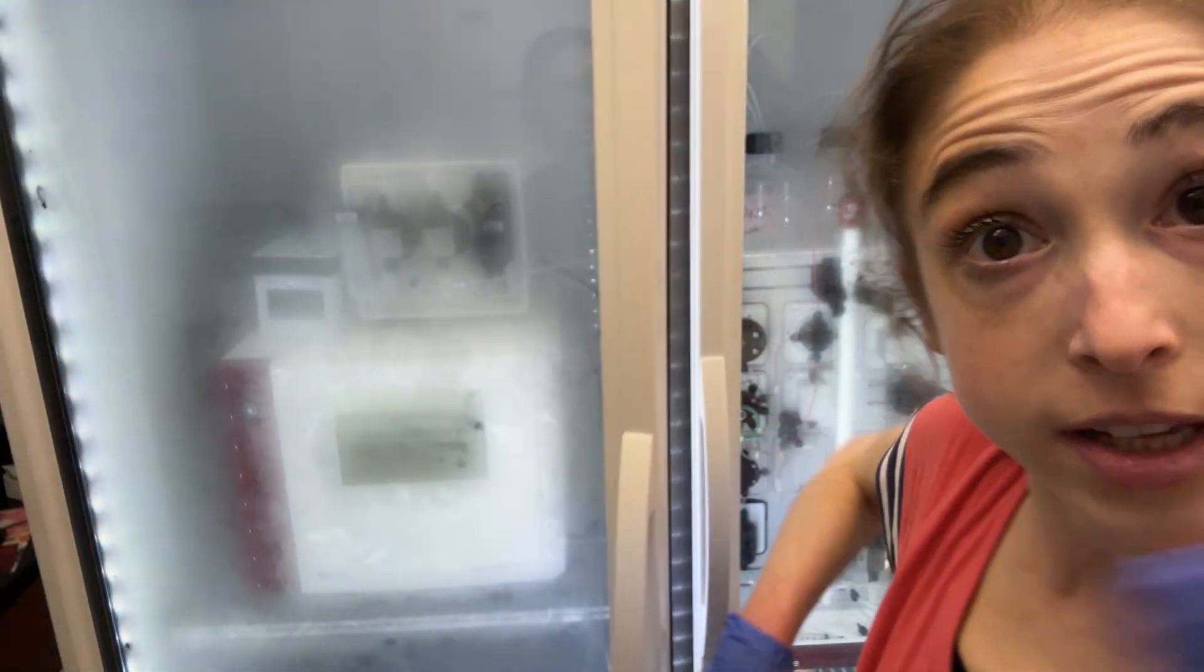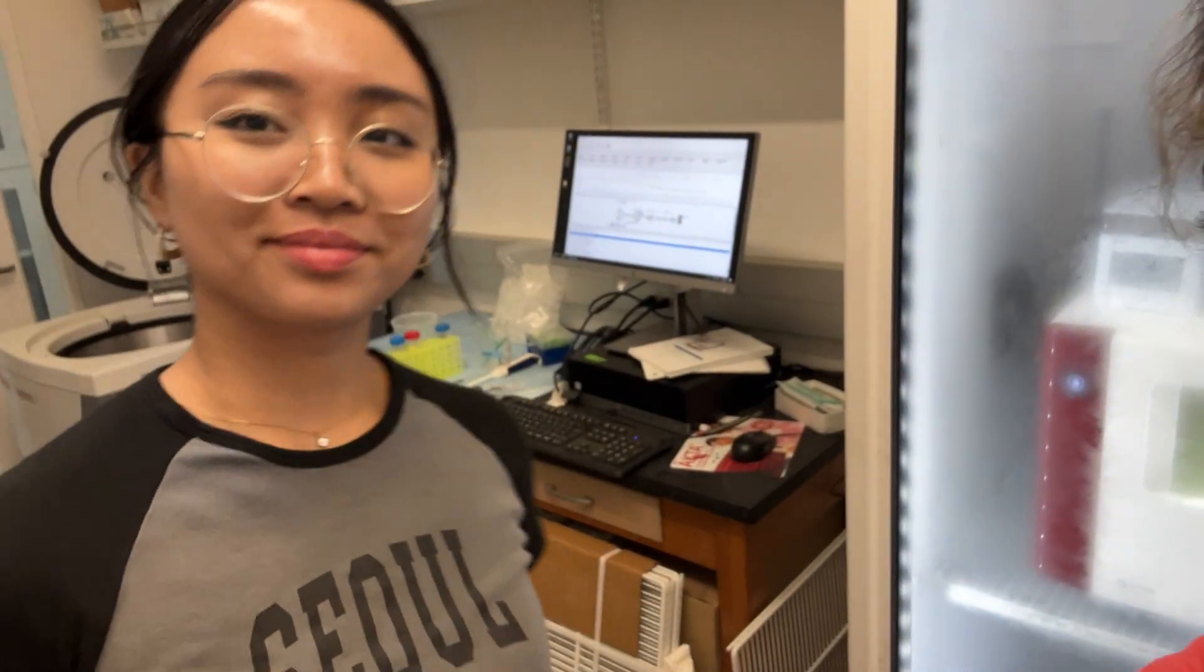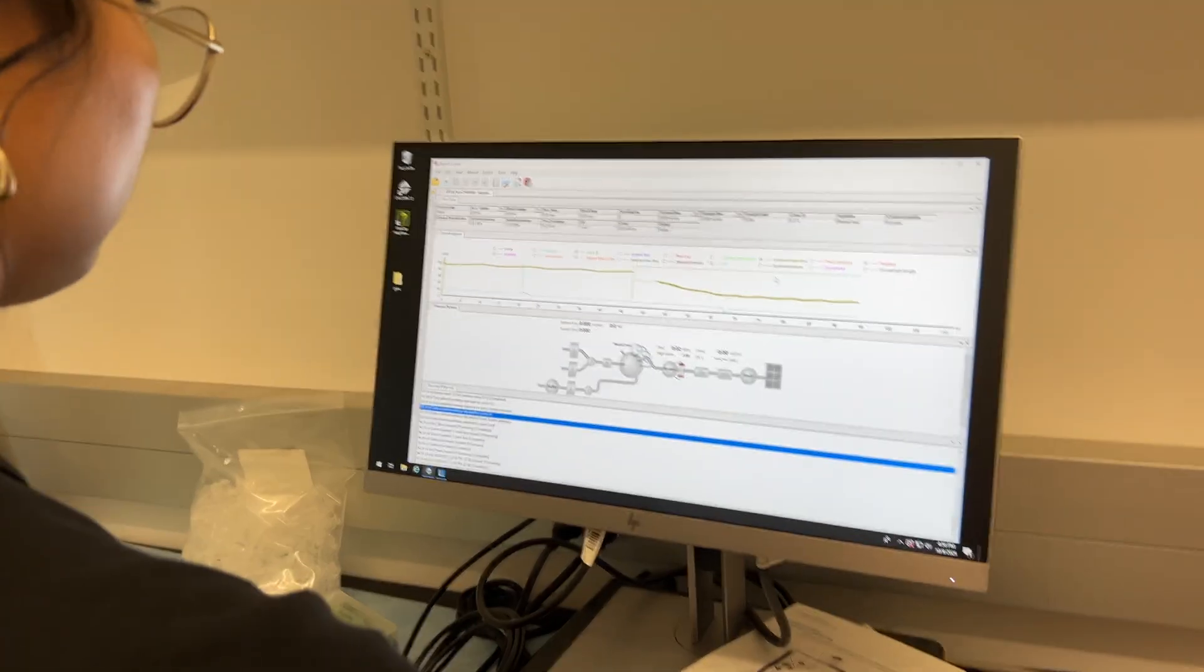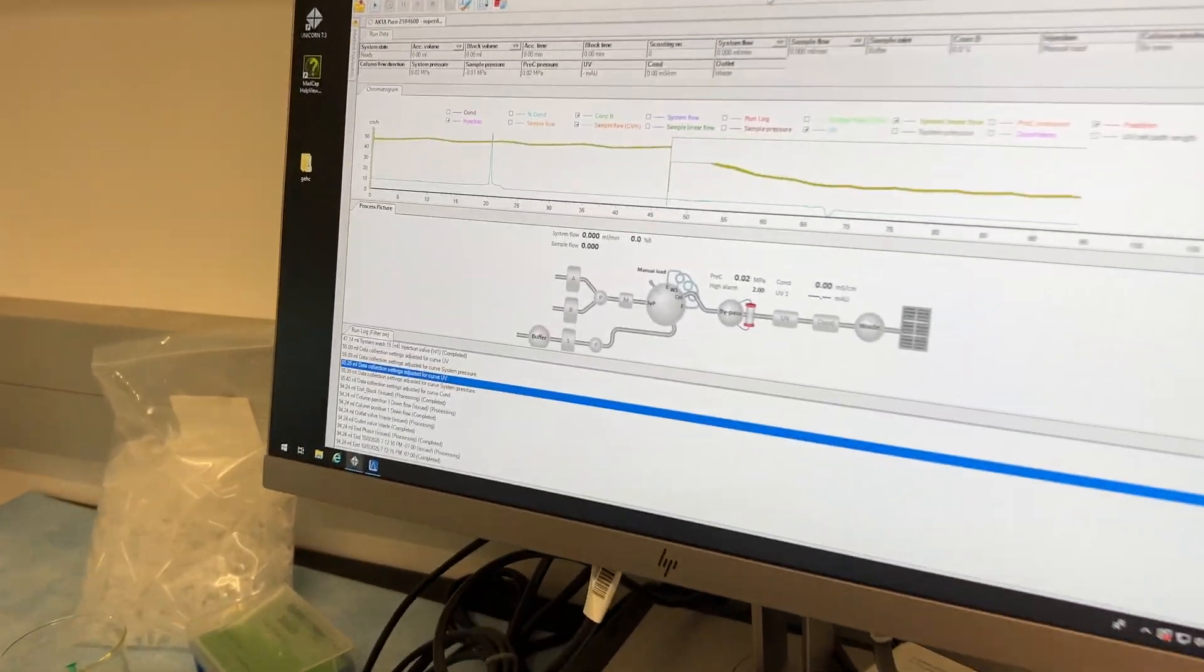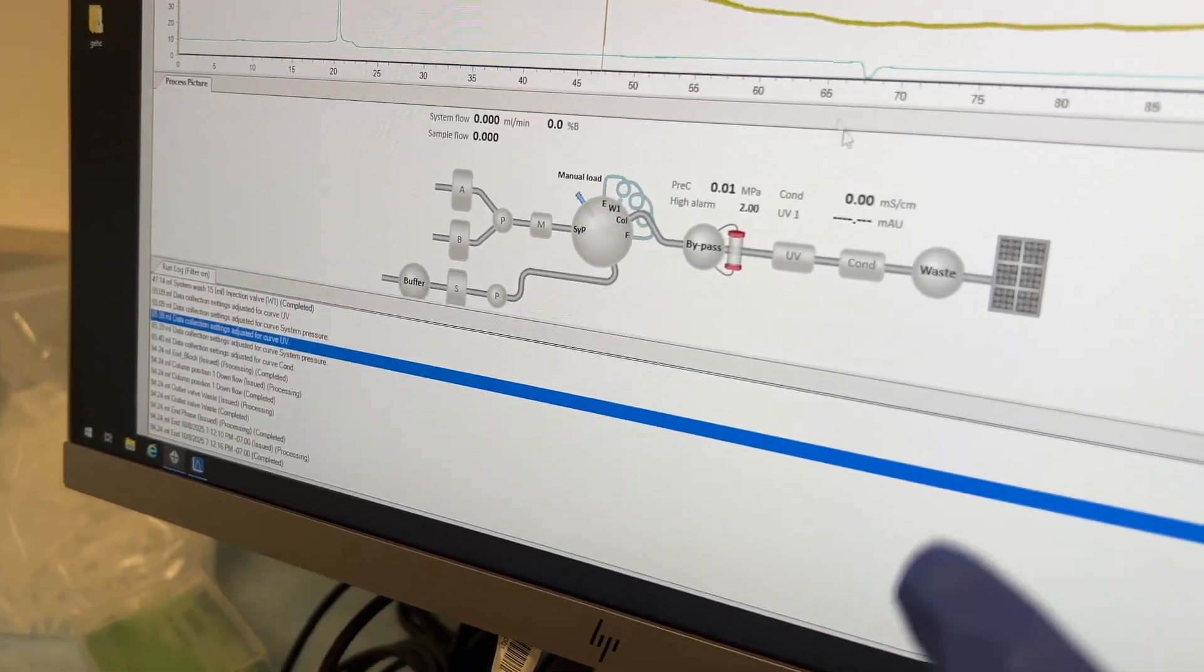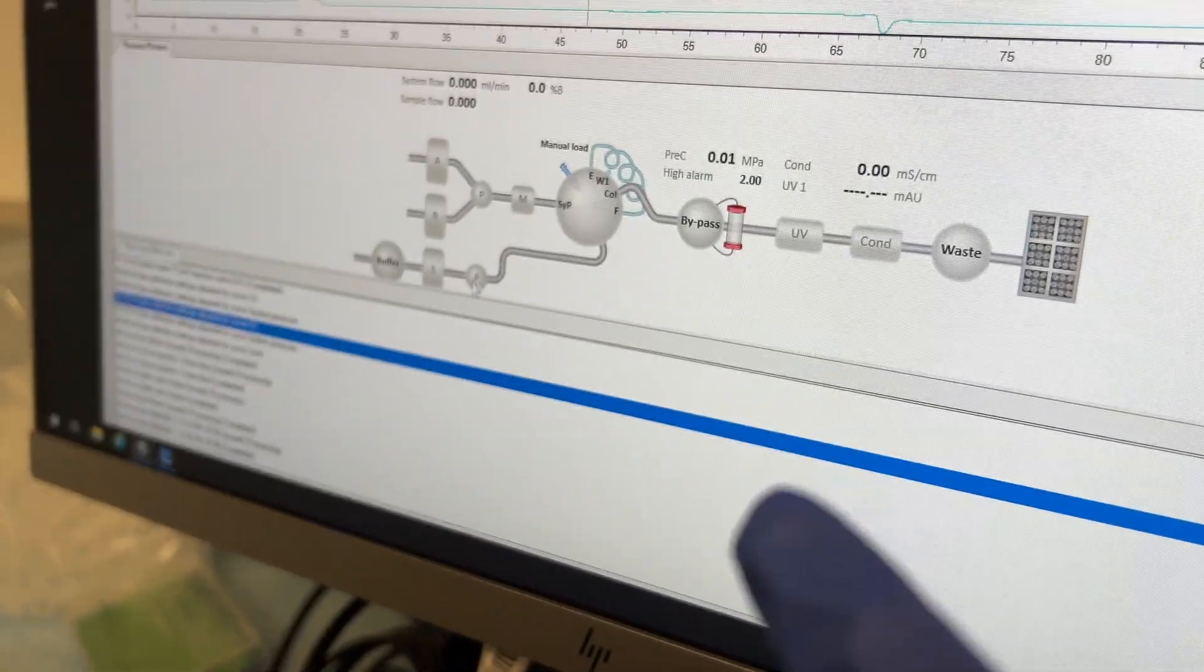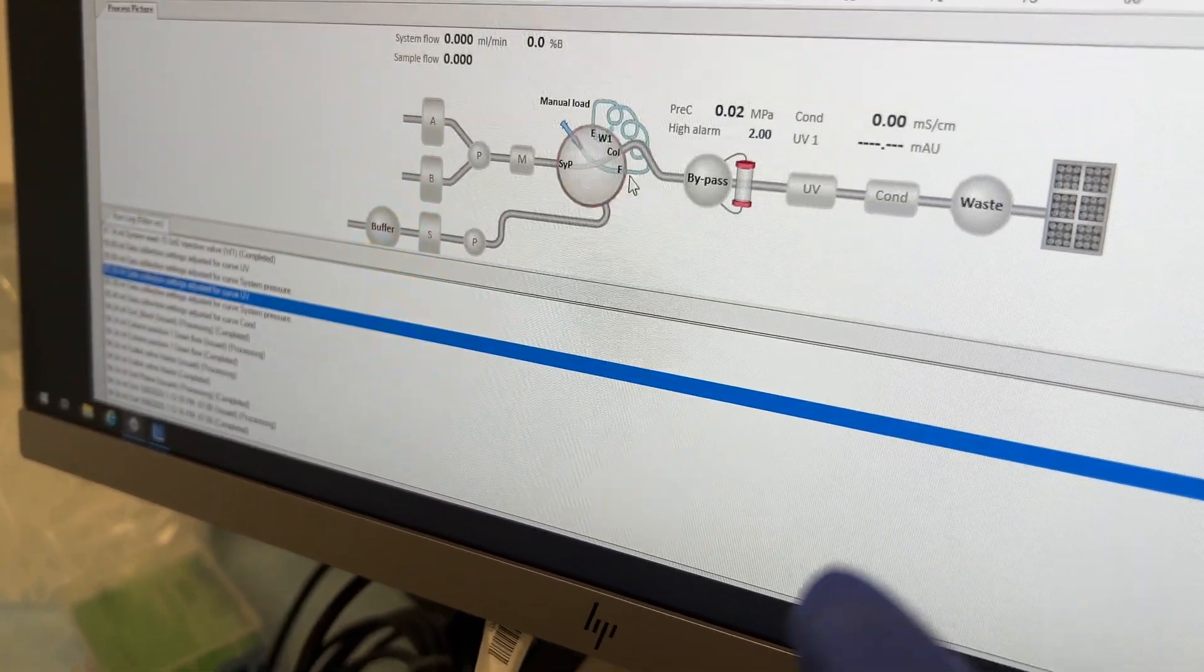And so Karina is going to show us how we can set this up in our Unicorn software. So we want to make sure that we're bypassing the column, which we are, which is great.